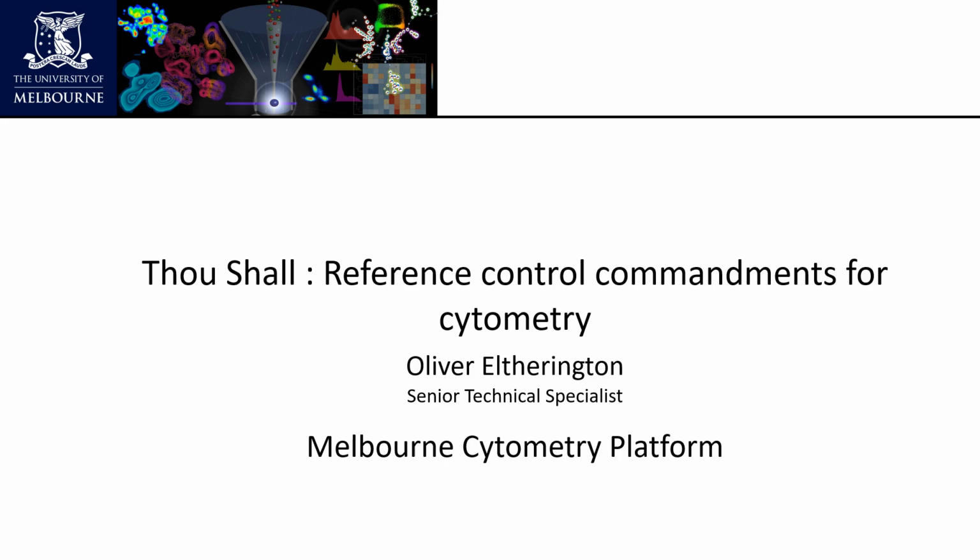In this video, we are going to take a dive into the rules that should be followed when making your single-stained reference or compensation controls, and what can happen if you break them. We will mainly focus on spectral instruments in this video, but these rules are equally applied across conventional instruments as well.